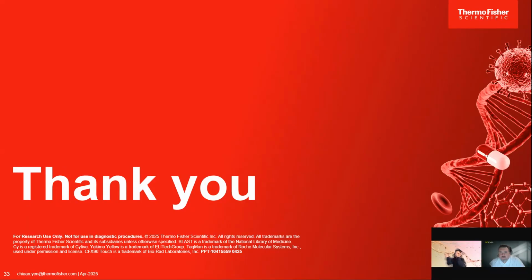but some of them will have maybe exon 1 and 5. I'm just making things up, 1 and 5, it could be 1 and 3 that's combined. Then you will design a sequence that's in between a junction to ensure that you can detect the different splice variants. But yes, I think that's doable. And one way to improve detection signal is you can try increasing the concentration of primer and probe, assuming that the primer sequences themselves are robust enough in picking up the target.